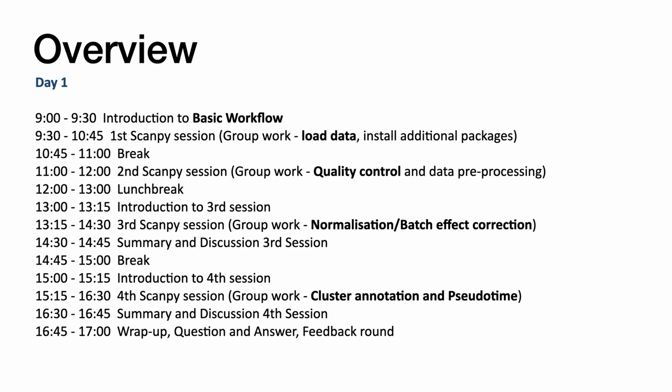Okay, first of all, I give you a brief overview of today's workshop. I first give you an introduction to the basic workflow. Then we go into the first Scanpy session in the breakout rooms, where we set up the environment. Whoever still had problems with the environment, we solve it there. We load the data, we install additional packages, and then we're ready to go. After the first session, we make a short break, and then we go into the second session, starting with quality control and data pre-processing. I should give a brief introduction to this as well.